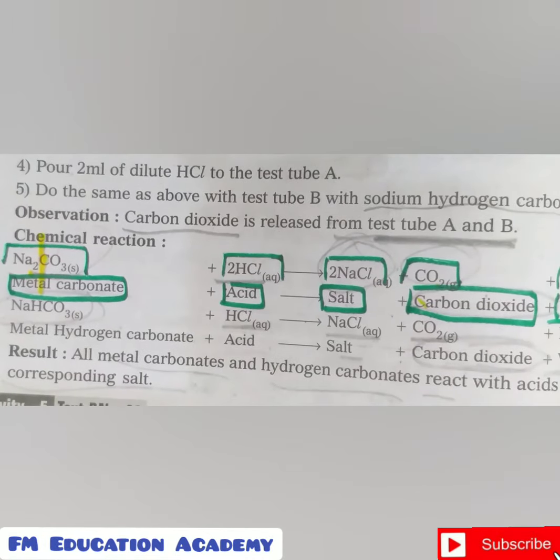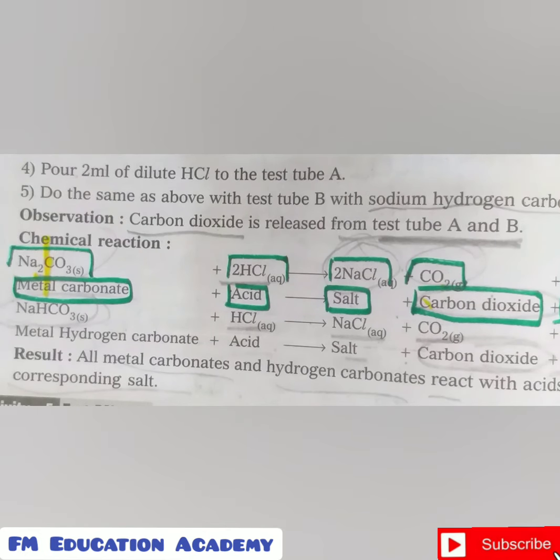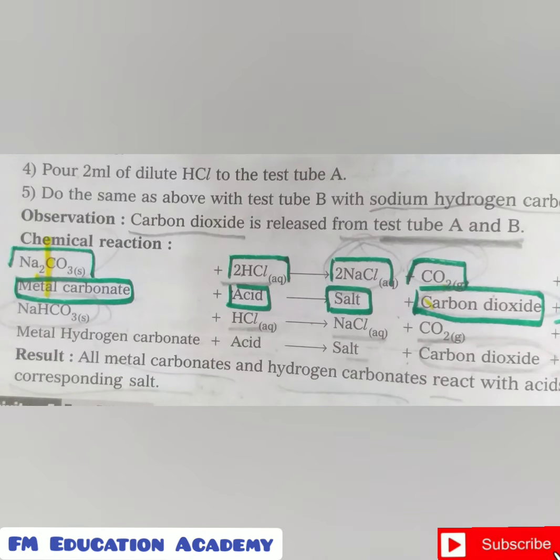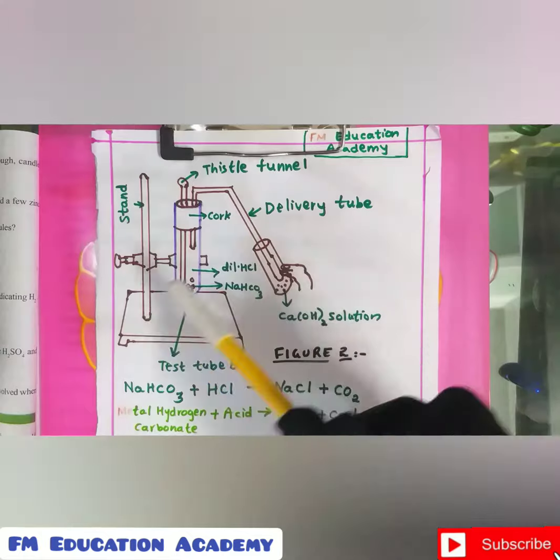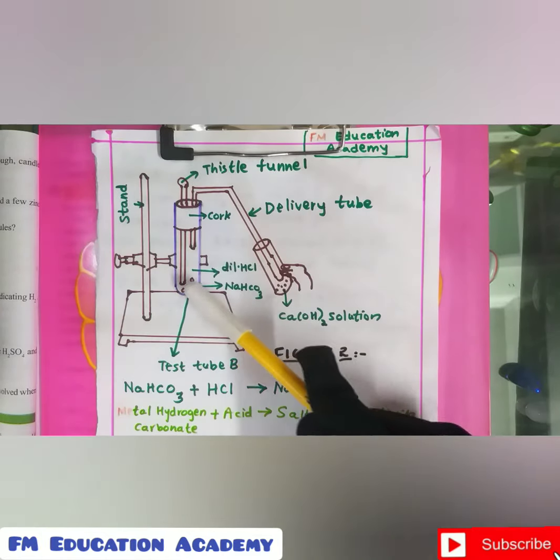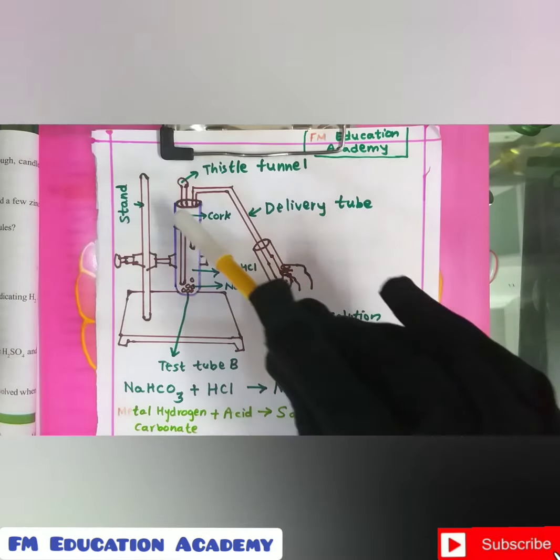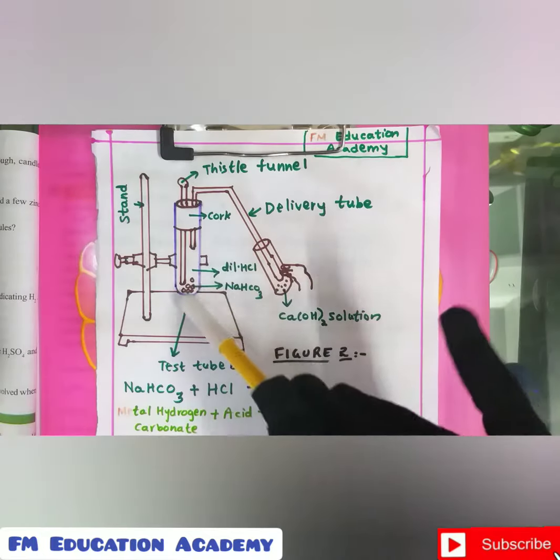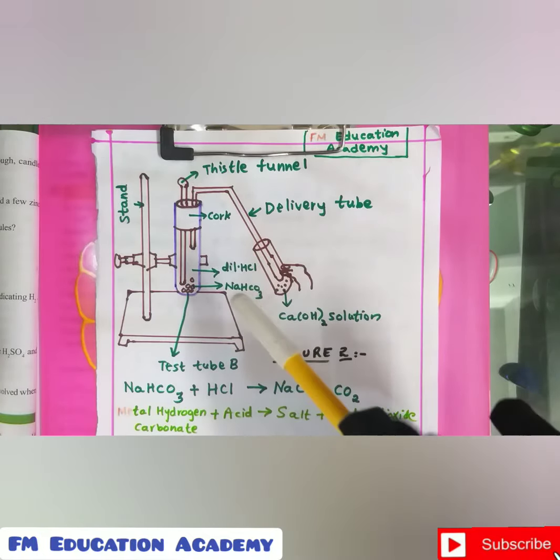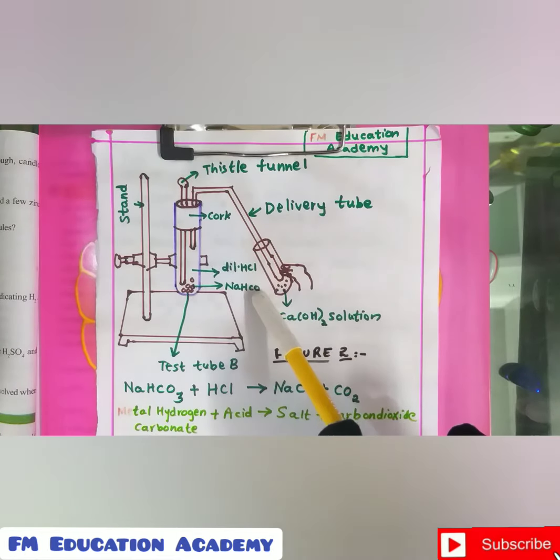Now let us take metal hydrogen carbonate in place of metal carbonate. That is, in another test tube B, we will take metal hydrogen carbonate and see what will happen. This is the setup which we are doing with sodium hydrogen carbonate. What is the only difference? Instead of sodium carbonate, this is my test tube B. I have replaced test tube A with test tube B on the stand. On the stand, I have fixed test tube B, and in that test tube B, I have poured sodium hydrogen carbonate. Already dilute hydrochloric acid, I am mixing with sodium hydrogen carbonate.